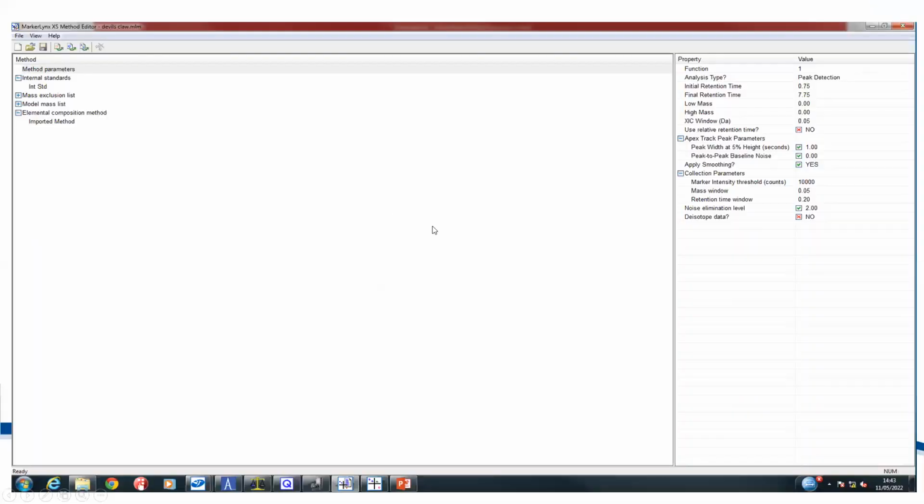The purpose of doing pre-processing is you want to do spectral alignment. Your LCMS data, you want to see the differences between the chromatograms in an untargeted approach. So for instance, you want to use your whole chromatogram. Maybe you're using high performance chromatography and you have your chromatogram starting at 0.75 minutes and ending at 7.75. So you want to tell the software that I want to include all the information when I do the SIMCA, the chemometrics. So you need to put in these parameters for peak detection.